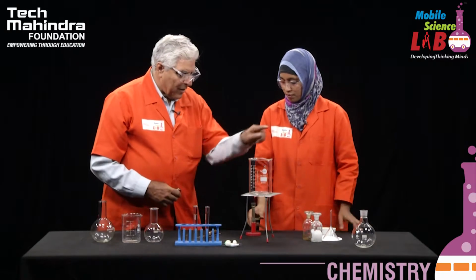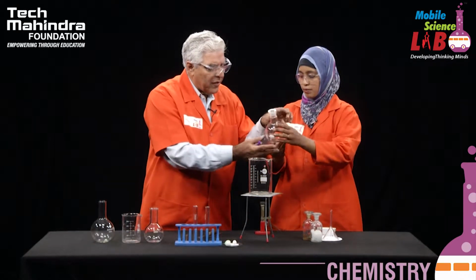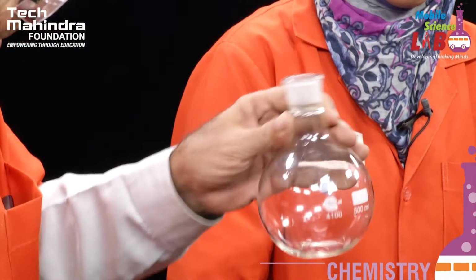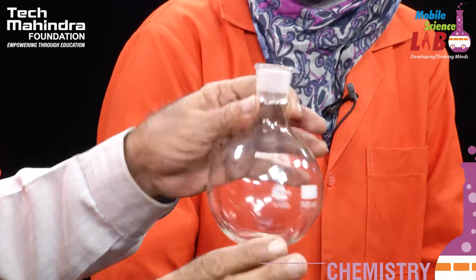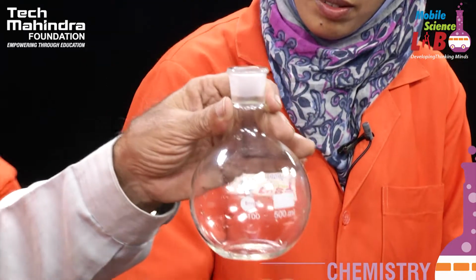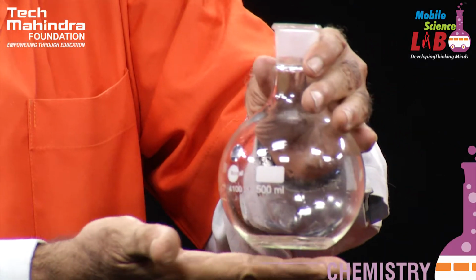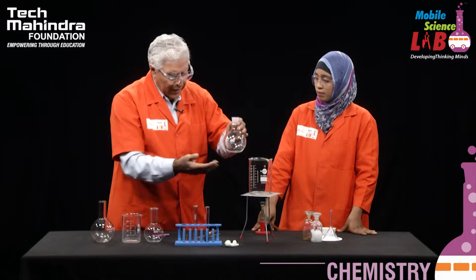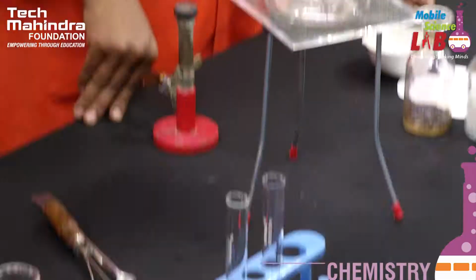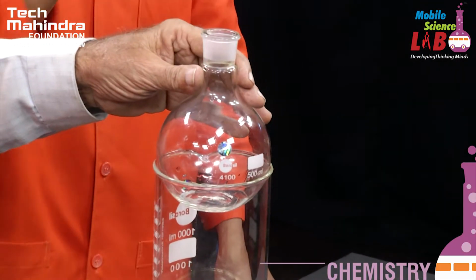And now, put that empty flask. Viewers, it is a dry surface over here. There's a little liquid water inside that won't make any difference for us. This is called a flat bottom flask because here, as you can see, it is quite flat. That is why we can put it on the table without it tilting this way and that way. So now what we will do is we'll put this flask over here.